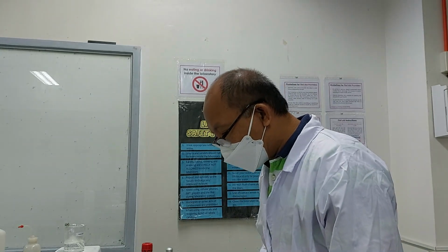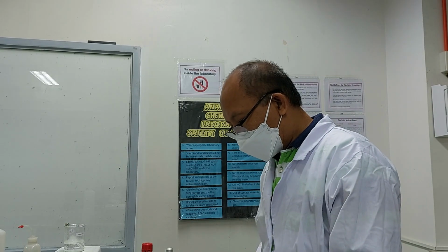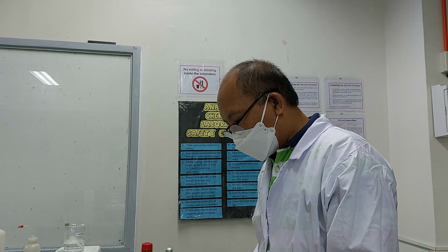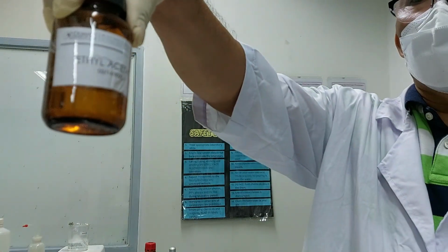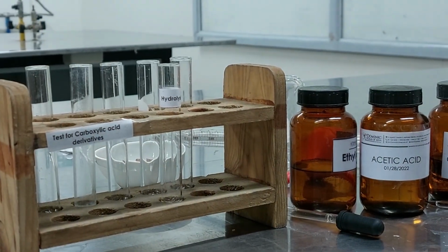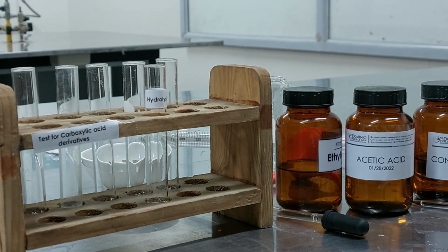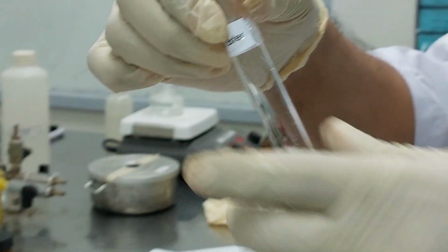So here we're going to do hydrolysis under basic condition, by the way. We're going to use sodium hydroxide to hydrolyze our ethyl acetate, that is our ester. So we have ethyl acetate here. This is the ester that we're going to hydrolyze using sodium hydroxide. And then we have sodium hydroxide, 5 drops is enough for this one.